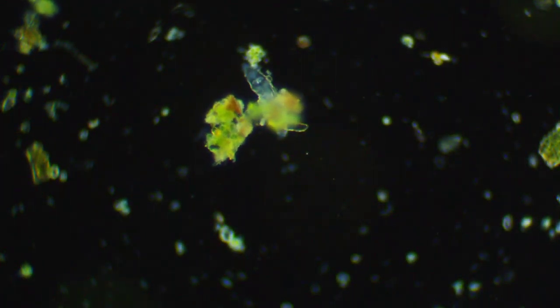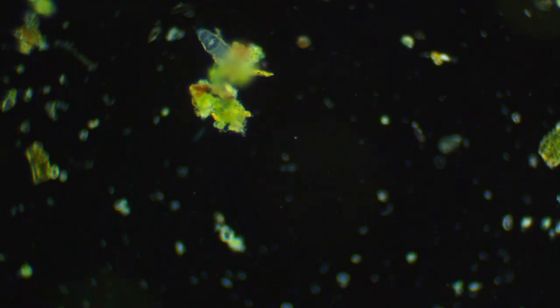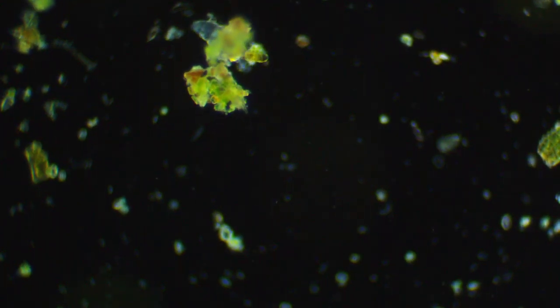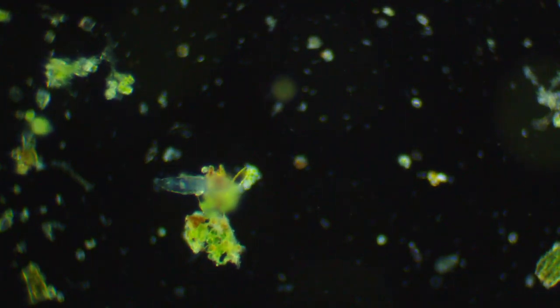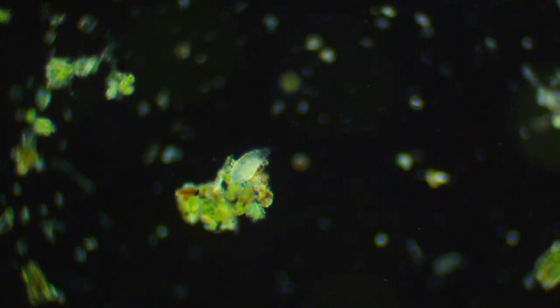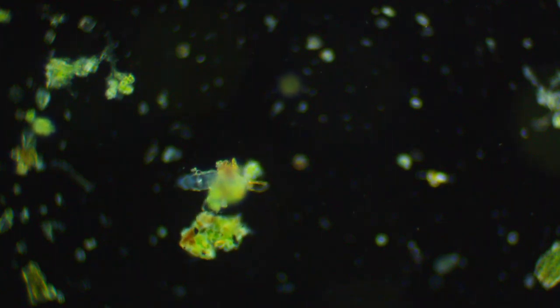But, you know, almost every time I get some moss that's growing on trees or on wood or dirt or a cliffside, you find these guys, these little rotifers. I've probably found at least 3 or 4 different types of these guys.